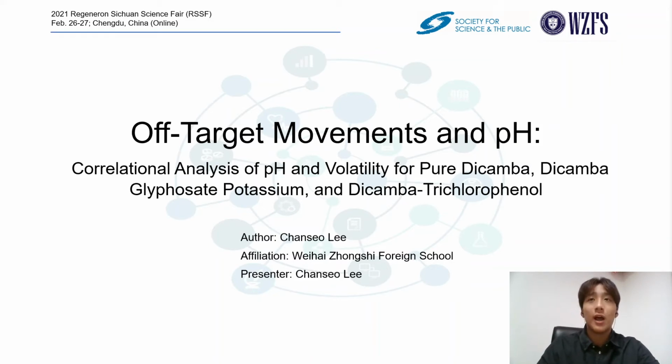In this video, I'm going to present my findings on correlational analysis of pH and volatility for pure dicamba, dicamba-glyphosate potassium, and dicamba-trichlorophenol.